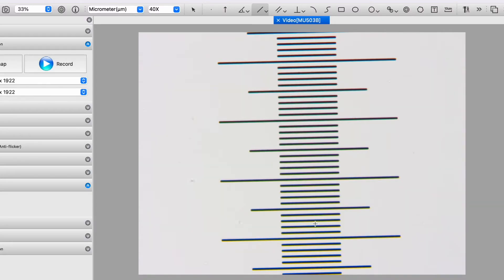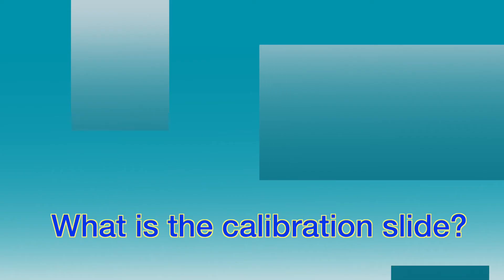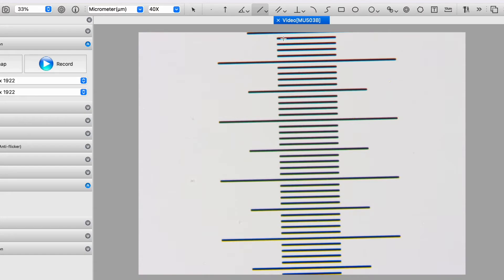What we're going to need for this procedure is a calibration slide. This calibration slide came with the Amscope MU503B camera, but if you don't have one you can probably get one from a microscope supply company or even Amazon. This slide is essentially a ruler with very fine demarcations — from one line to the next, the distance is 0.01 mm, equal to 10 microns.